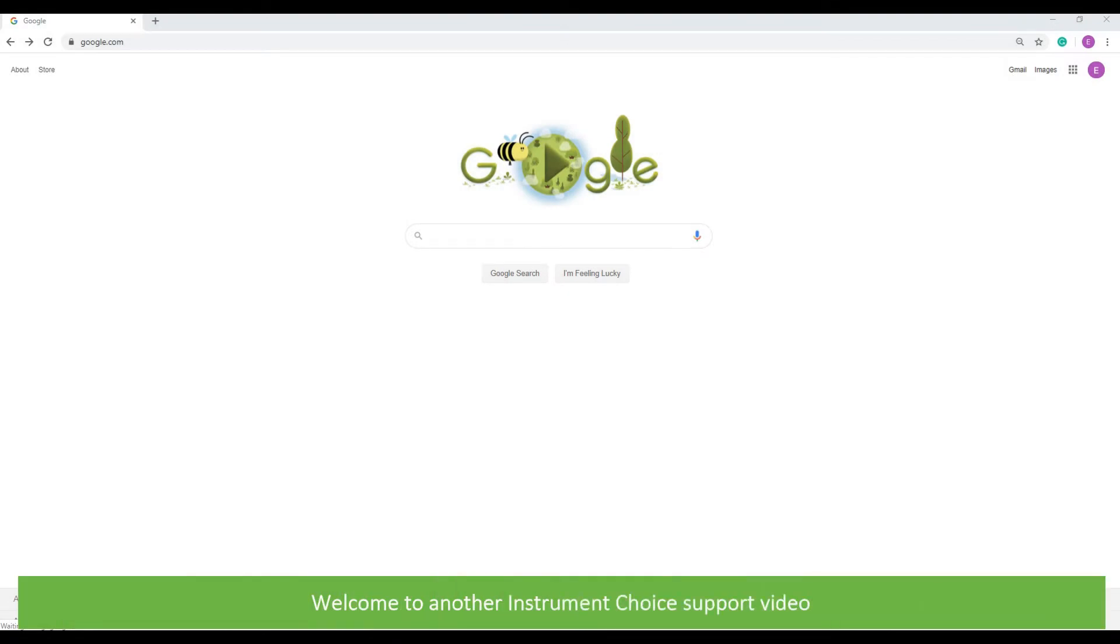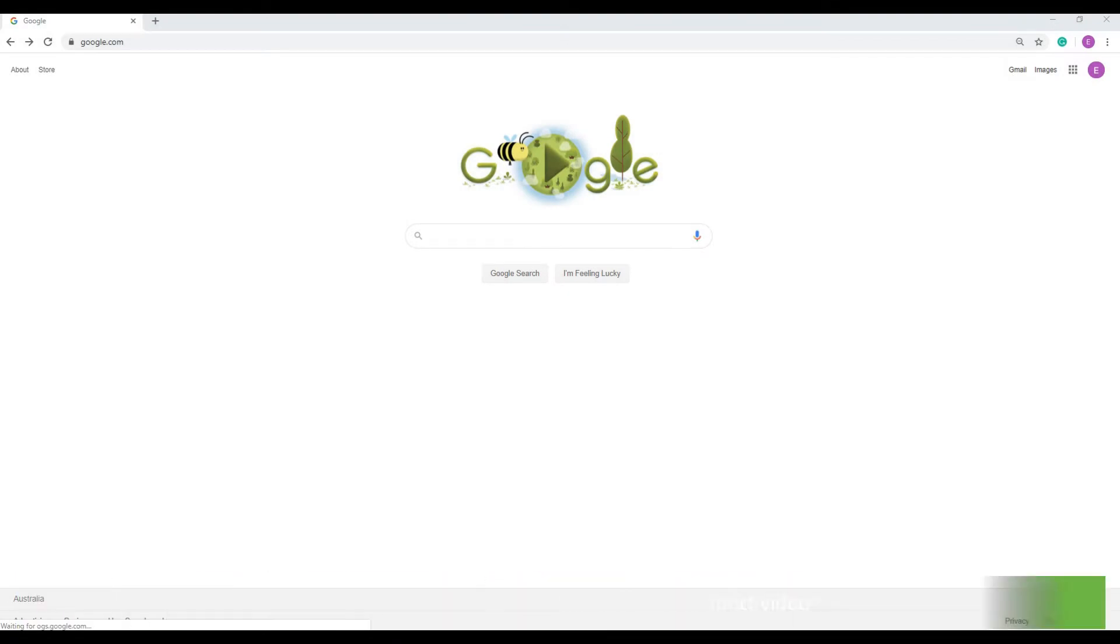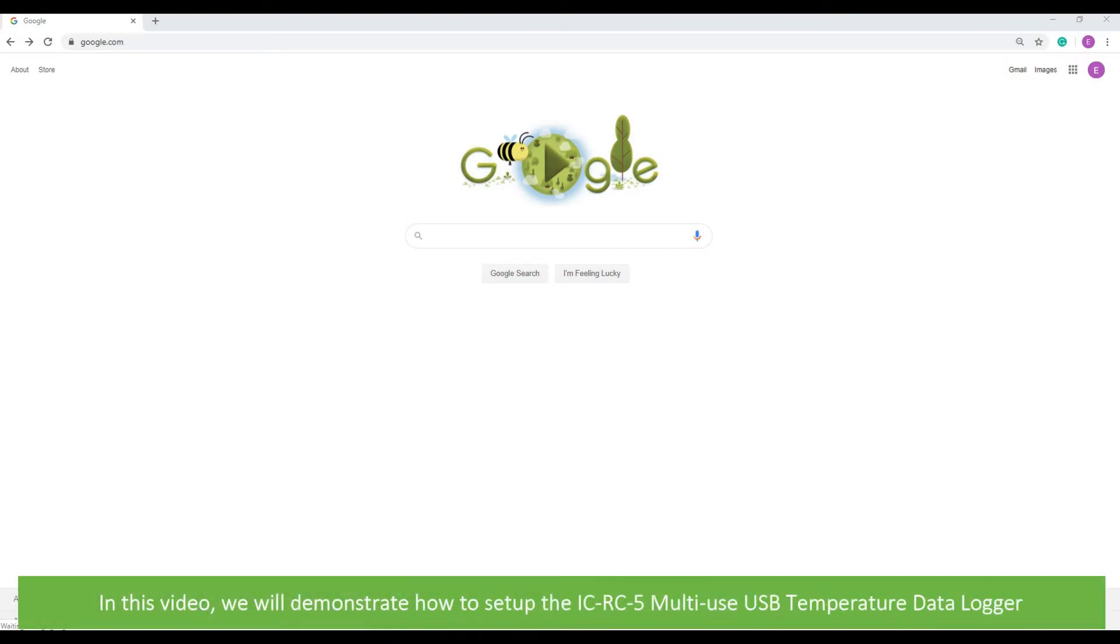Hi and welcome to another Instrument Choice support video. In this video we'll demonstrate how to set up the IC-RC5 multi-use USB temperature data logger.